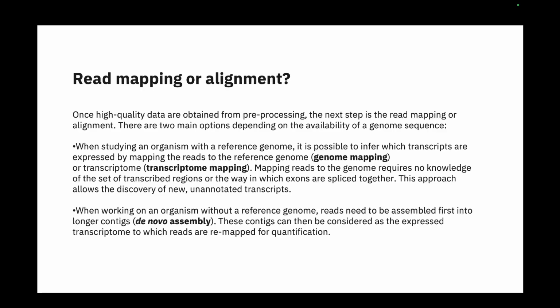So it's not that the reads will always be end to end, they can overlap. So there is another question of computational algorithms when you're trying to use them. Are they considering overlaps, or are they not? These are the kinds of things you need to think about.